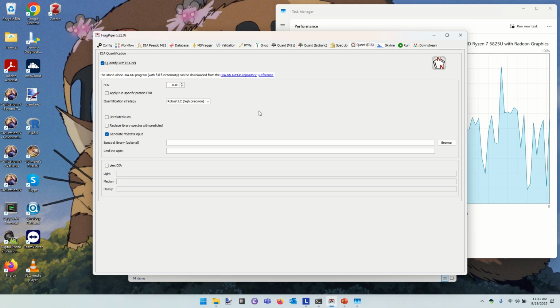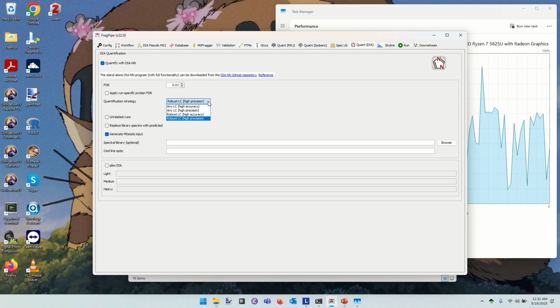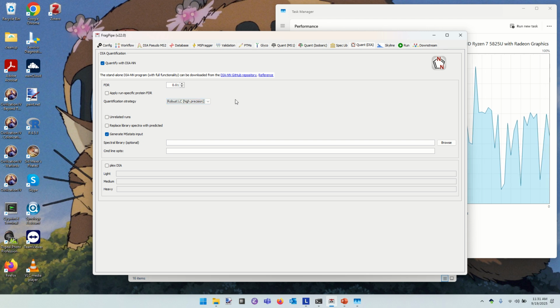Yeah. On the quant DIA page, I wanted to see where iRT gets called into play. It doesn't get included here. The quant DIA tab is limited. I would agree. Put it that way. And so unless you know all the command line options, you don't really stand a chance. Hence my question. Yeah, the devil is often in the details.